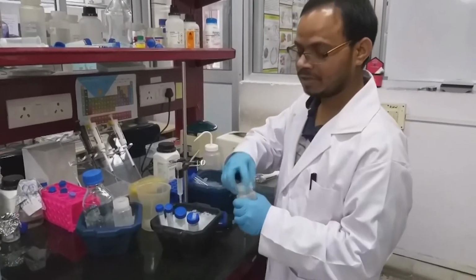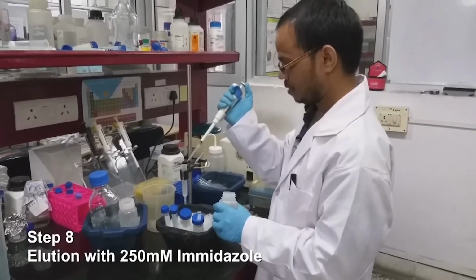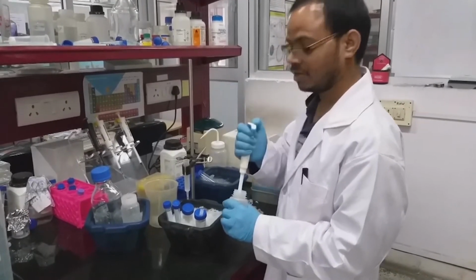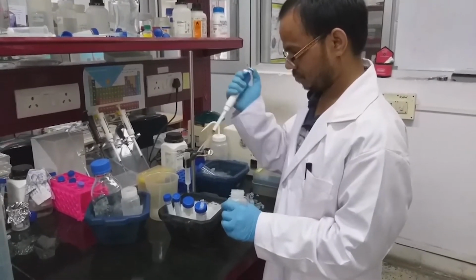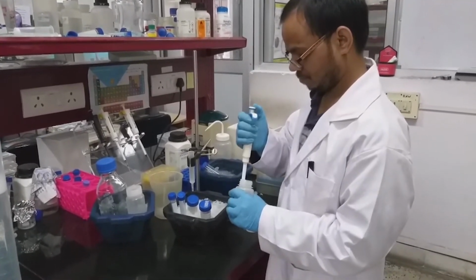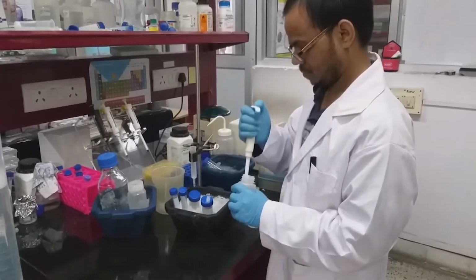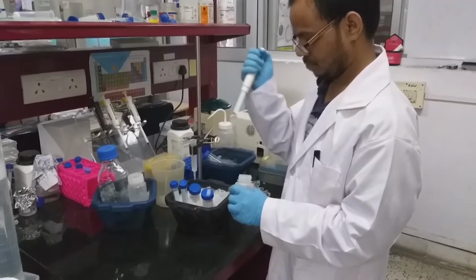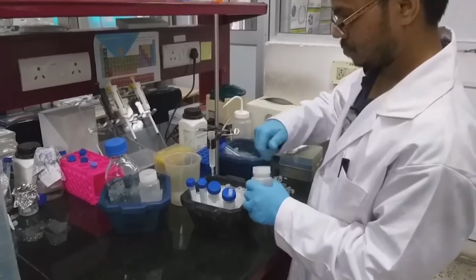Final step, we are going to elute with the 250 millimolar imidazole containing buffer. So what we are going to do is incubate the beads with this buffer for some time and collect the fractions. Now we have to collect the fractions.